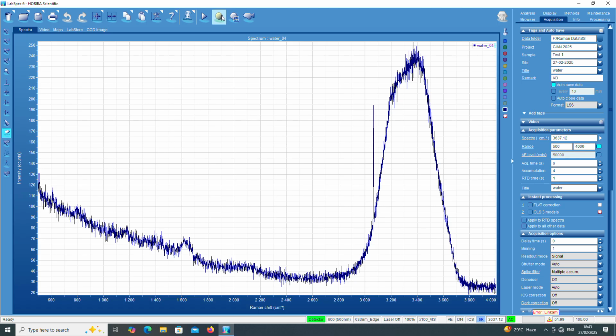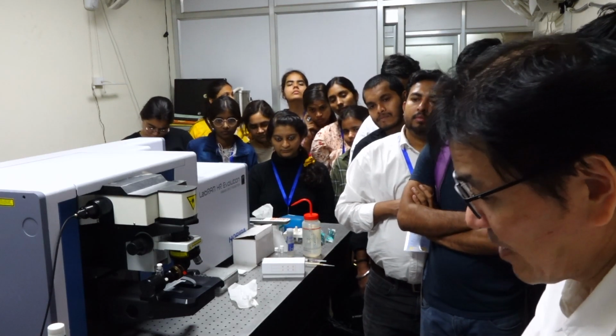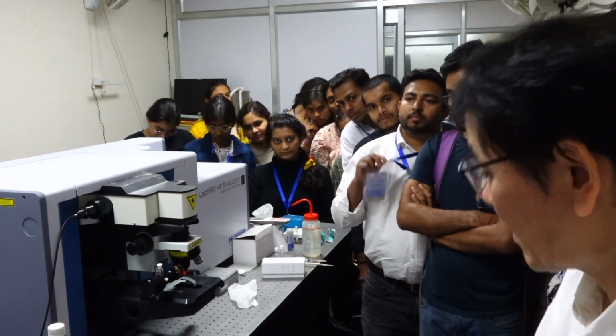The vibrational band of a liquid sample should have a certain width, and this is extremely sharp. So we should not regard this as a real vibration band. If this were a vibration band, it would mean the vibration continues for a long time, so we could define the frequency uniquely. Instead, this is not a vibration band.